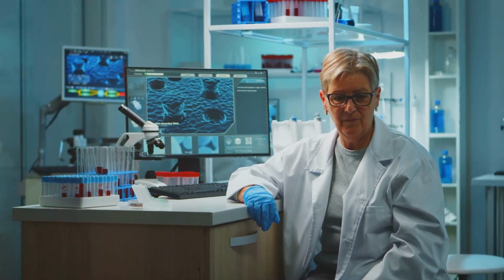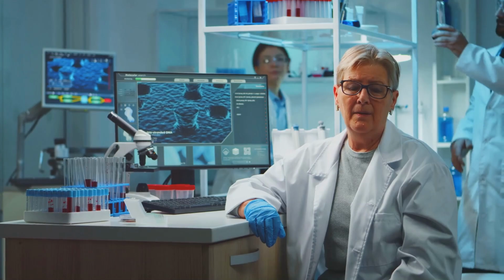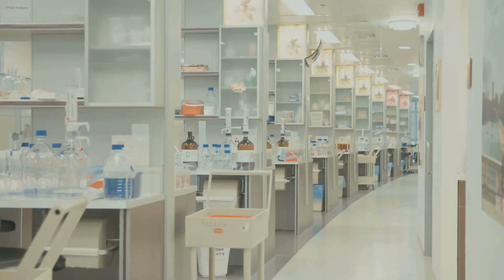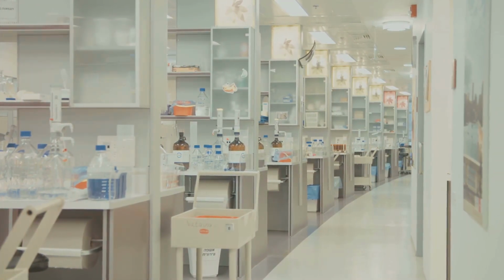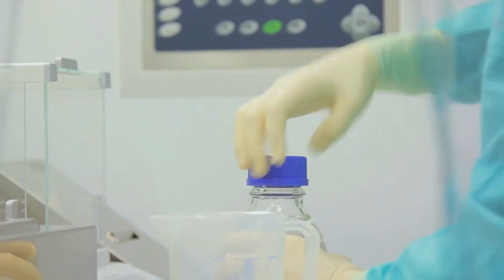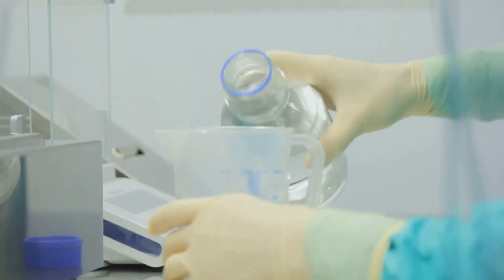Always check your detergent's CMC in the supplier's catalog or datasheet. For example, DDM has a low CMC, while OG's CMC is much higher. A low CMC means you'll need less detergent, which is not only efficient but also helps save on costs, an important consideration for any lab budget. Prepare a concentrated stock solution so you can add detergent without diluting your precious protein sample. This keeps your experiment consistent.